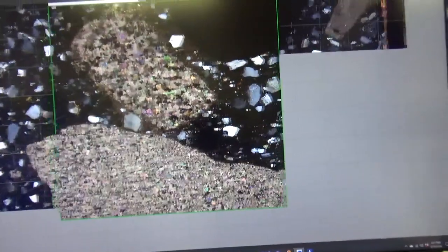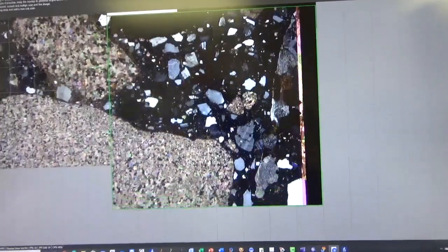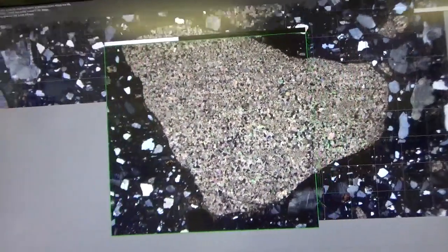scans. So from these two scans, in 10-15 minutes, you can see carbonation of paste around the dolomite aggregate particle here. All of that information you can obtain when you are doing your whole slide scan. So this is an important part of the exercise during petrographic examination.